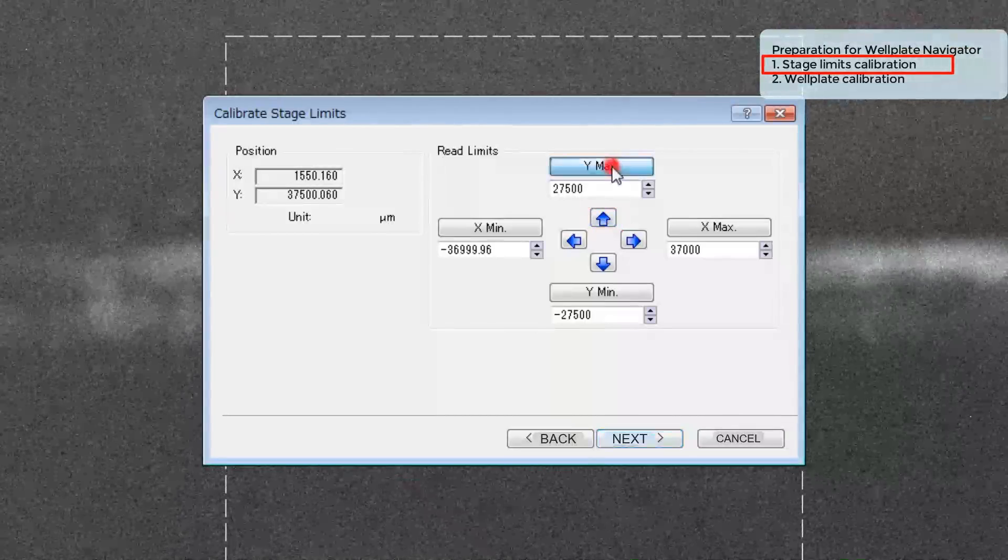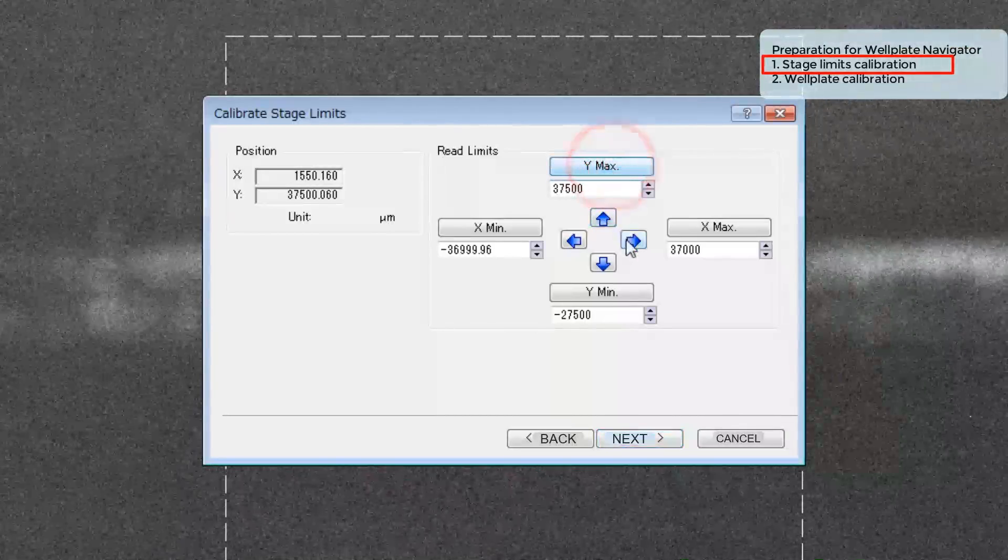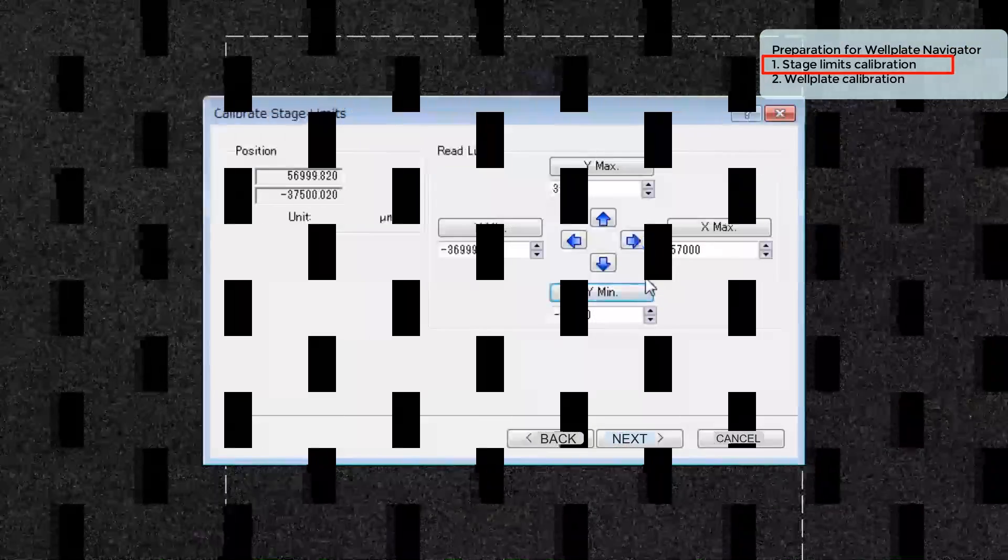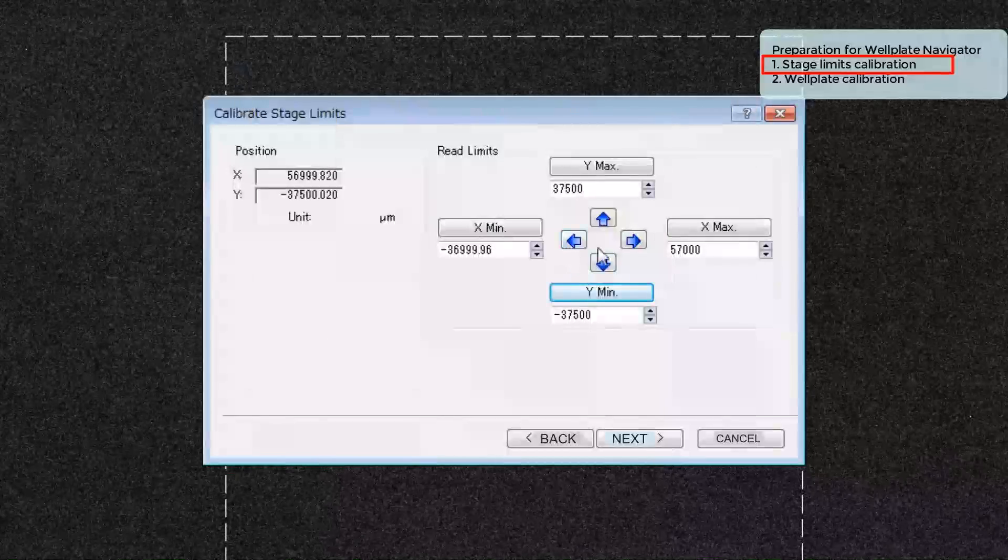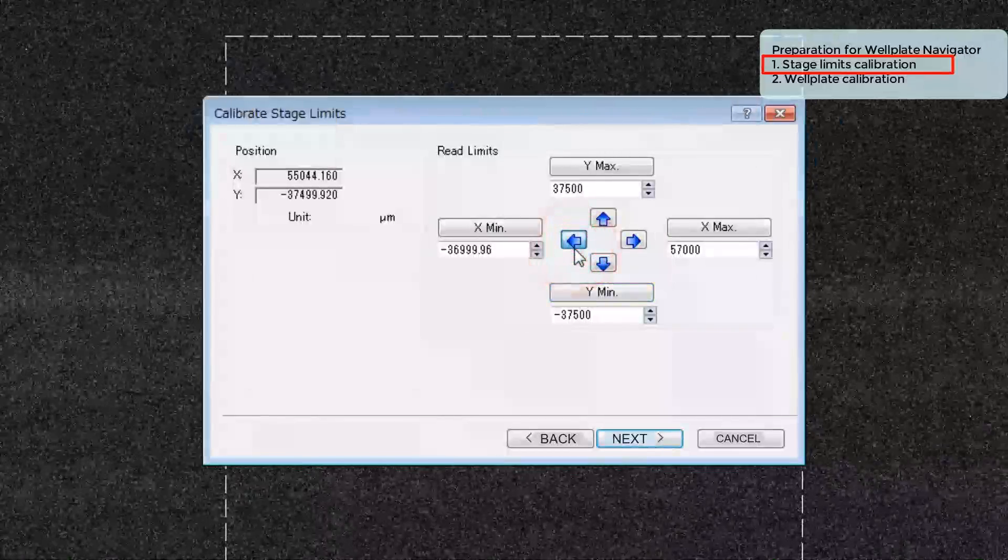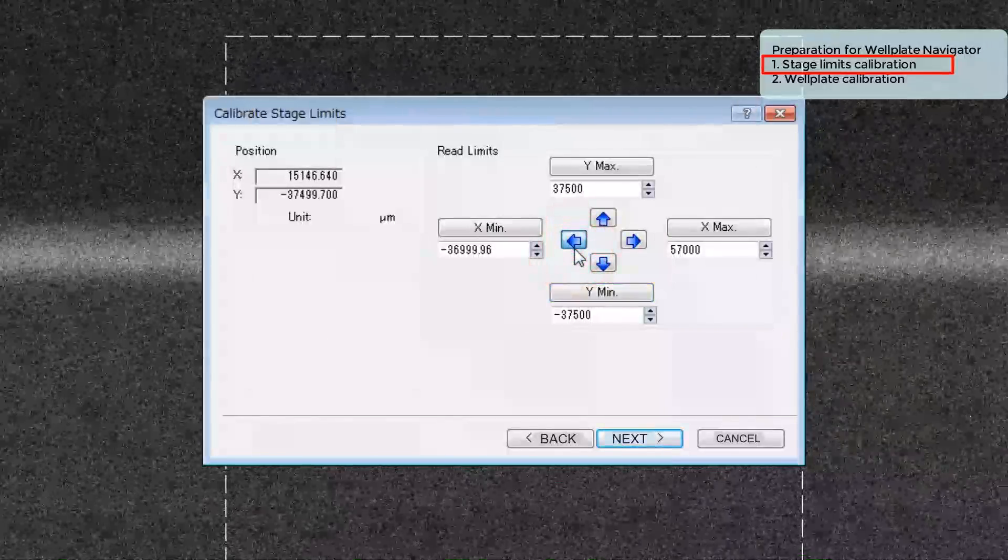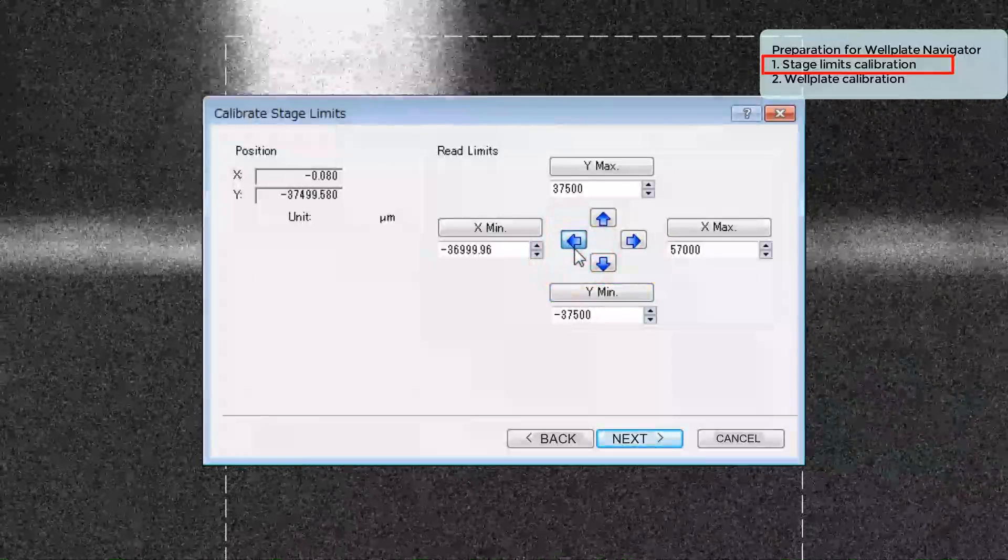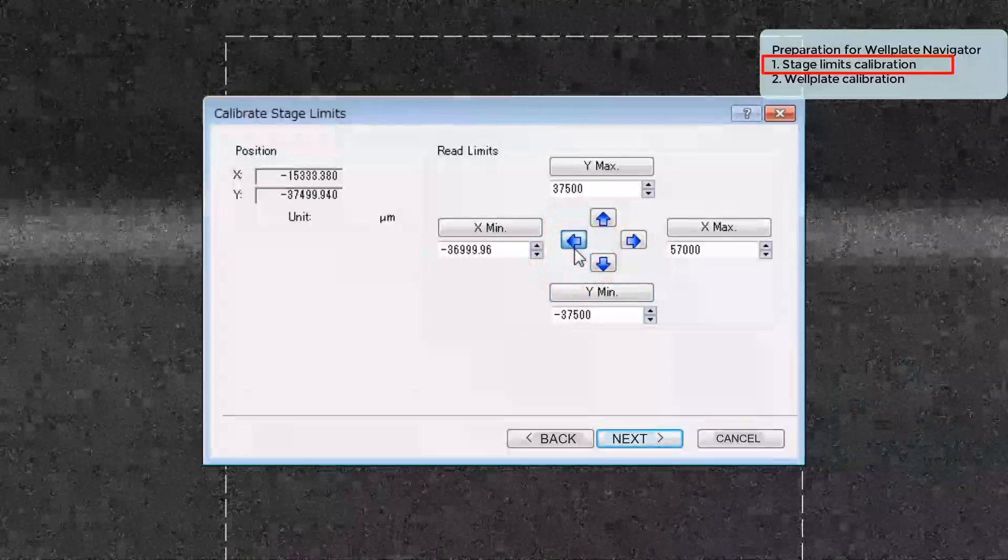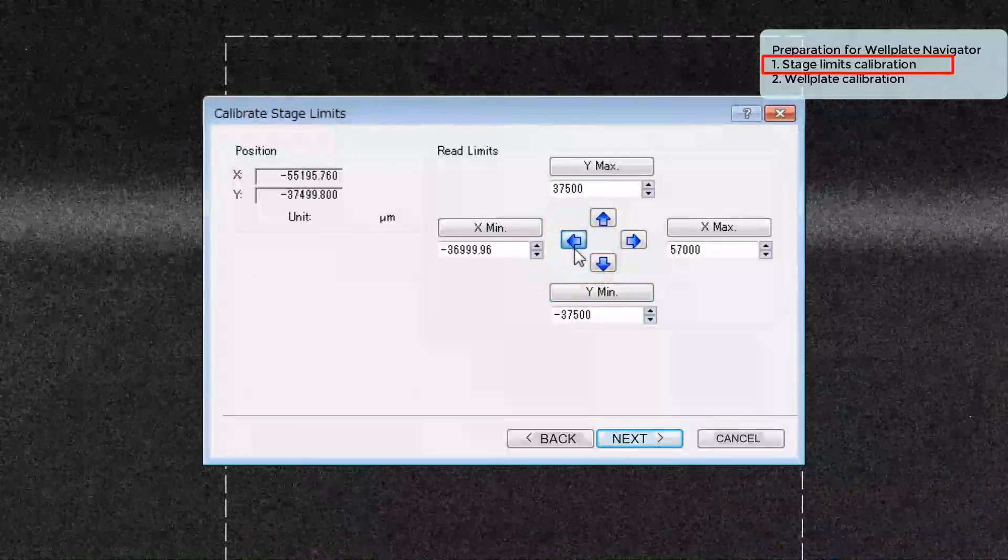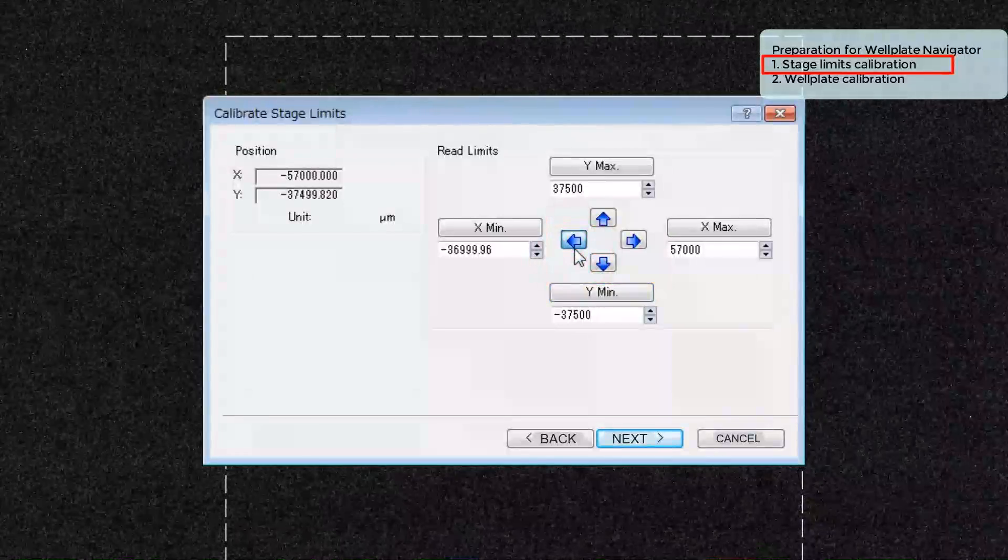Repeat this process for X Max, Y Min, and X Min. If you already know the values, you can enter them directly in each box. Now the stage can drive to the full range of its mechanical limits.